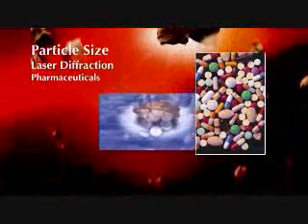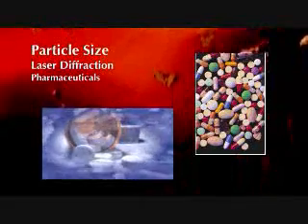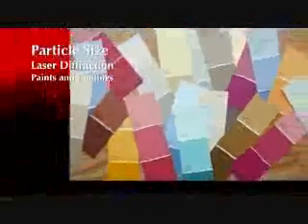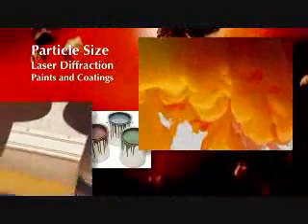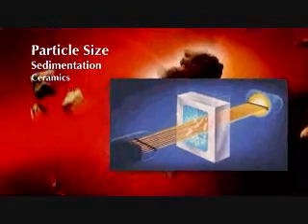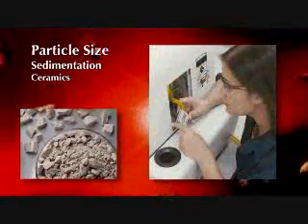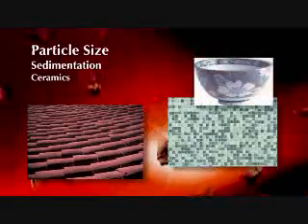Particle size plays a major role in the ability to process, blend, tablet, and package a drug substance. The useful shelf life and dissolution rate depend on the particle size of the material. The particle size distribution of the pigment or filler influences the porosity, gloss, texture, color saturation, brightness, solids content, and film adhesion properties. Sedimentation particle size distribution information helps determine curing and bonding procedures, control pore structure, ensure adequate green body strength, and produce a final product of desired strength, texture, appearance, and density.